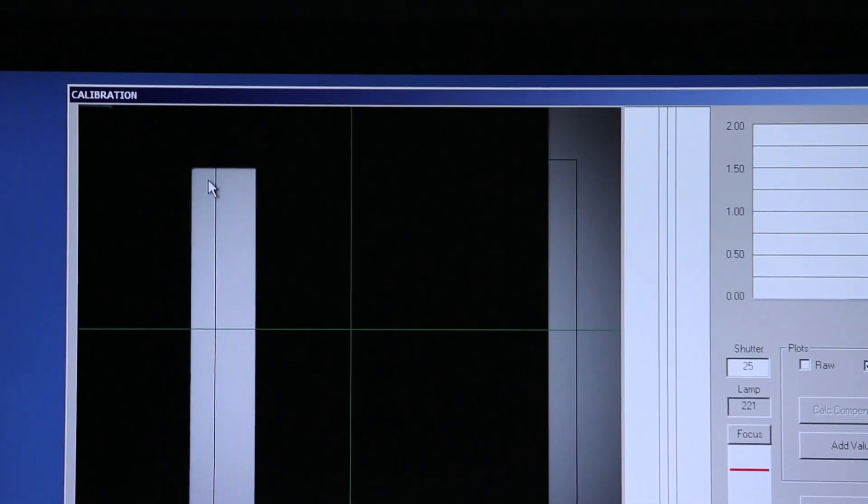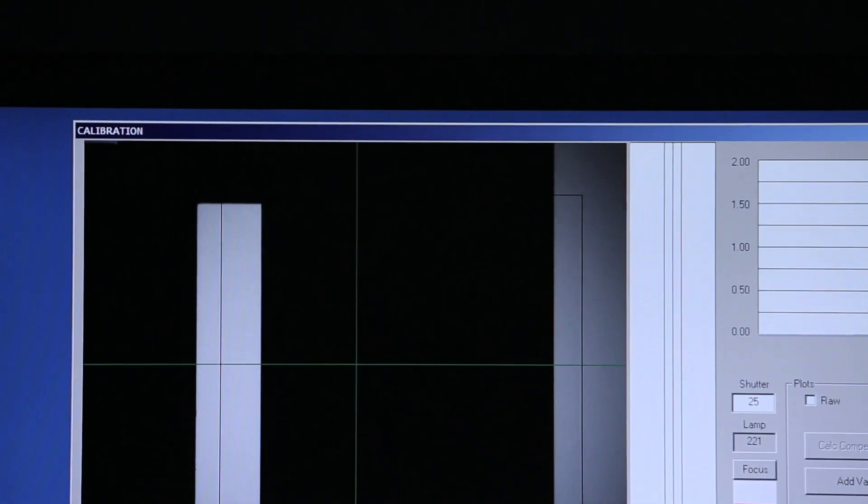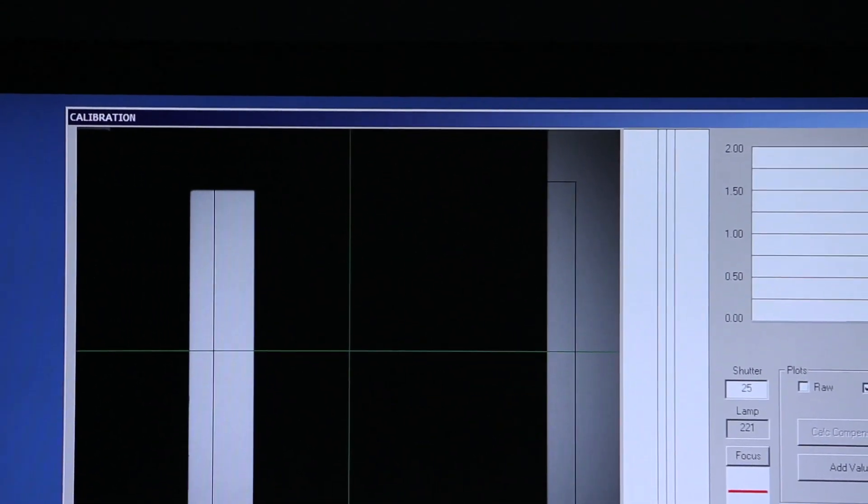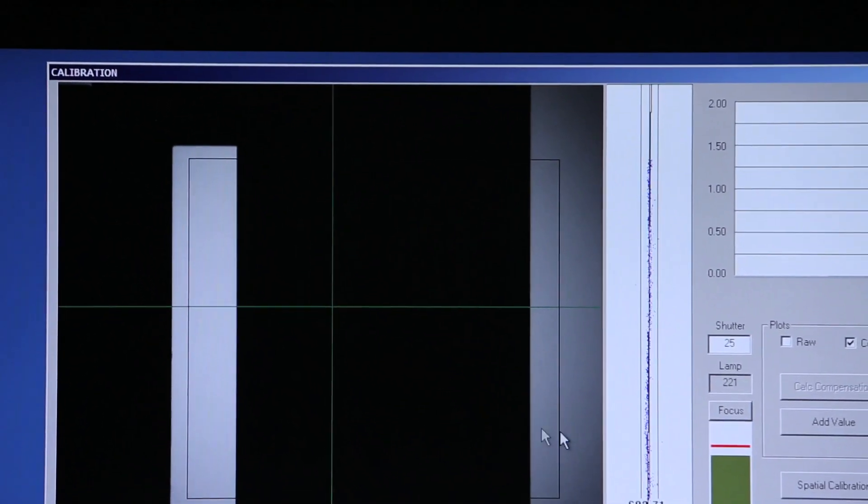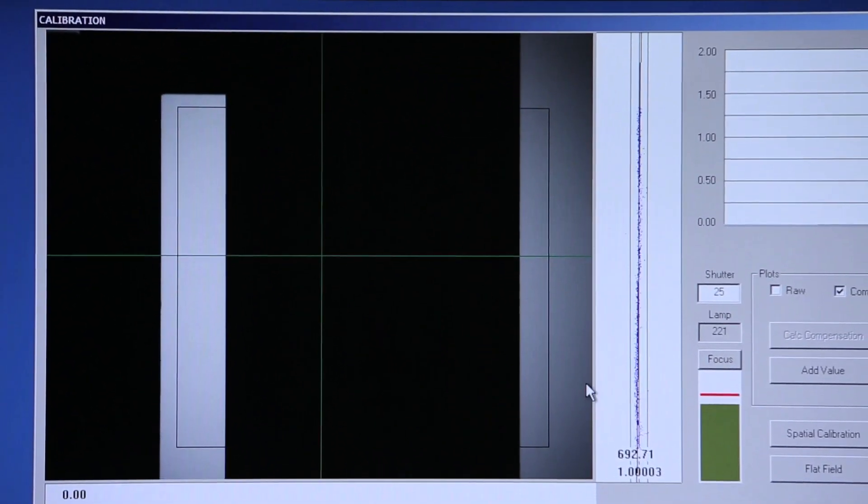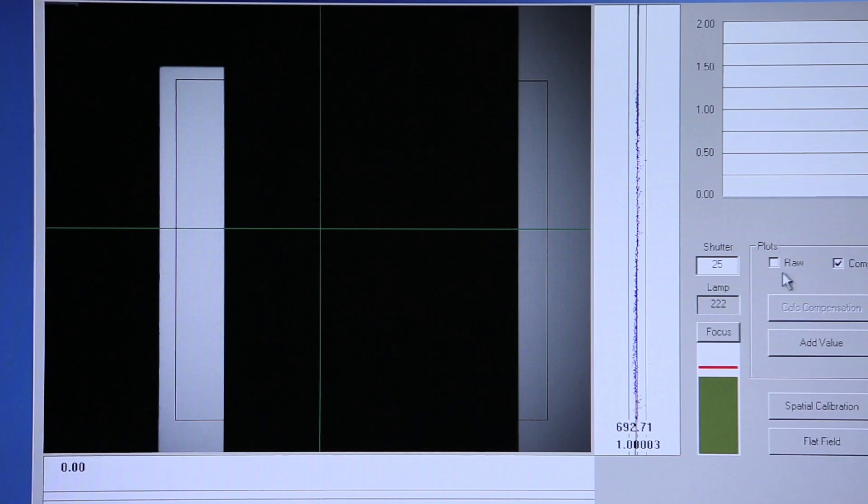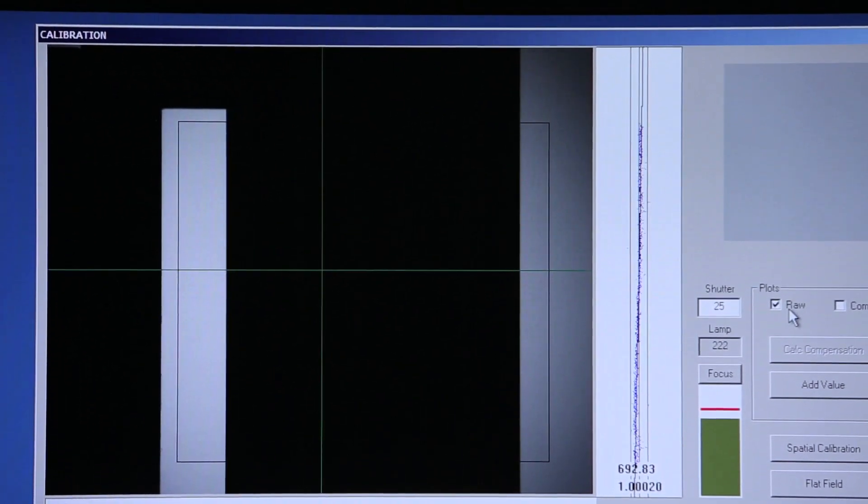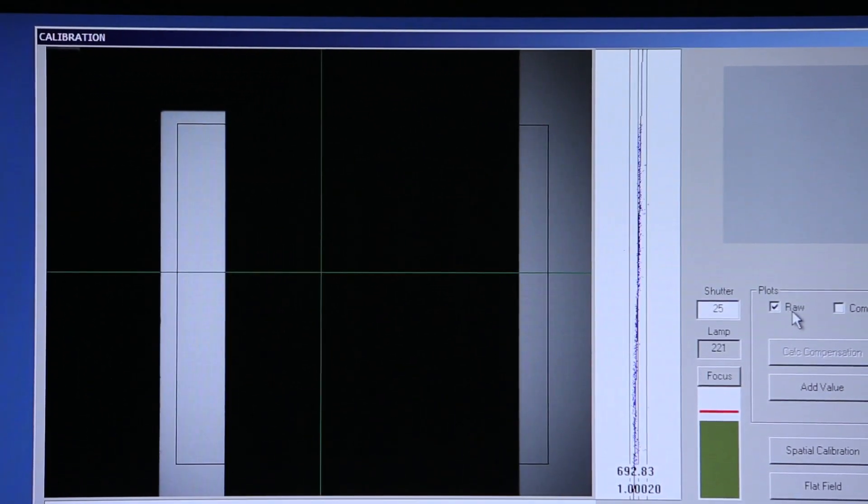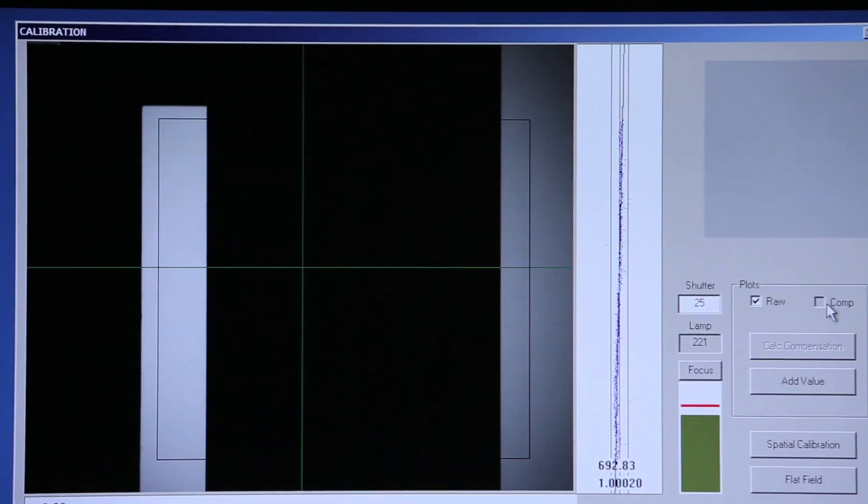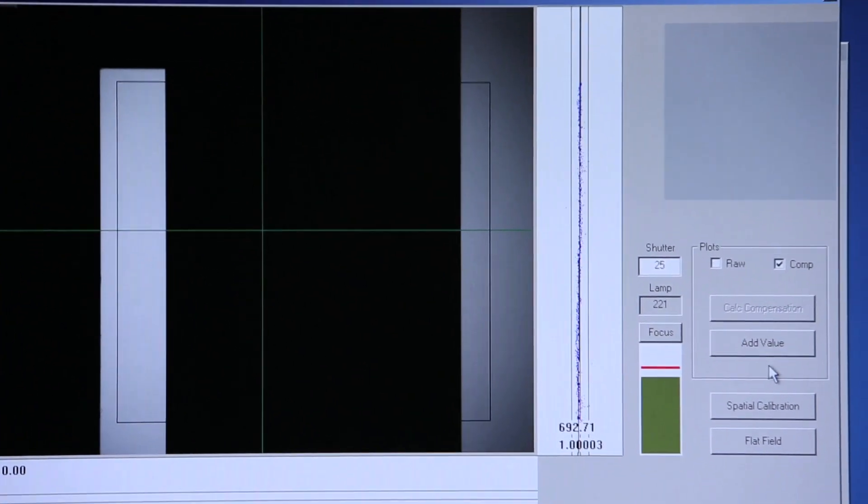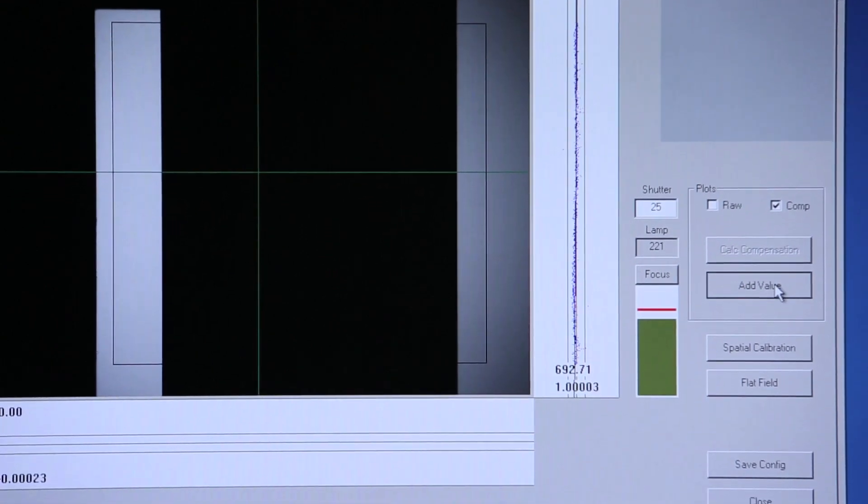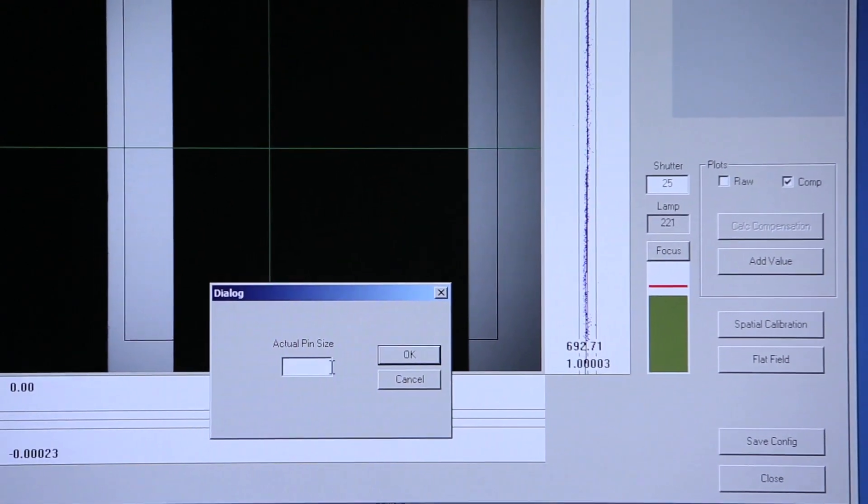We'll change the size of our tool window, again trying to get an equal amount of gray pixels on both sides. Look at the Raw button for any high spots, compensate, and add value.